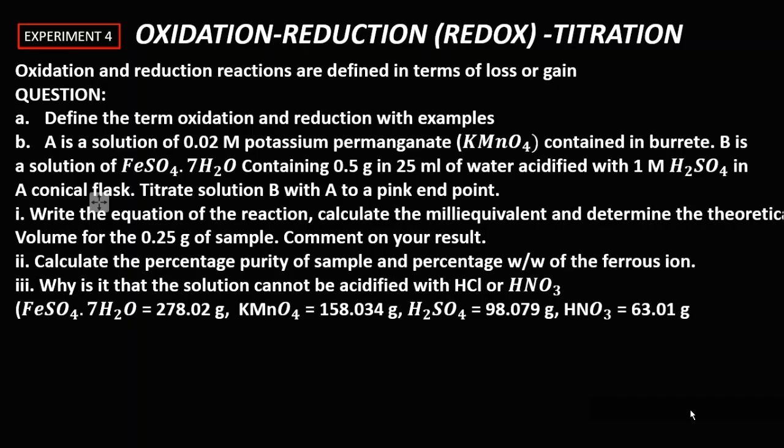So for this practical, we talked about oxidation reduction reaction, which in short is called redox titration. Now, I told you that in titration, the only thing we are looking for is the number of moles of this that react with the number of moles of this. Another thing you need to know is that the potassium permanganate used for this redox titration is a secondary standard.